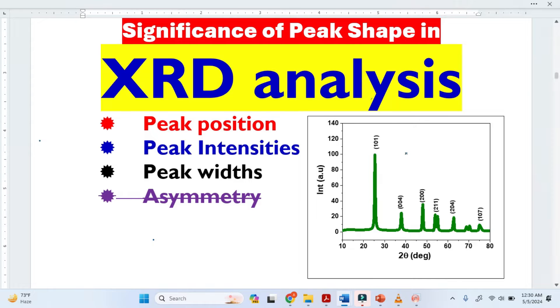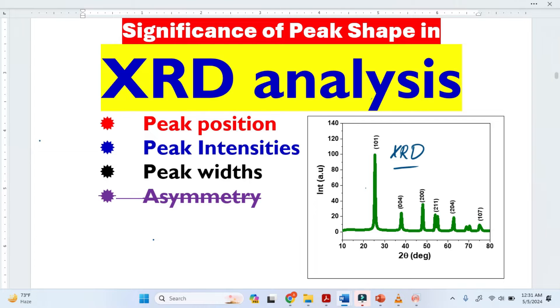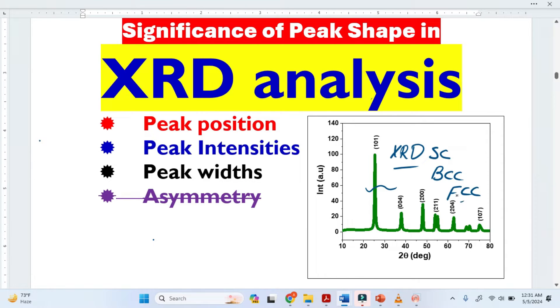Once we have the XRD pattern, we can extract a lot of information from this pattern. For example, we can extract what is the crystal structure of a material — whether it is a simple cubic, body-centered cubic, face-centered cubic, or hexagonal. So from this pattern, we can extract these kinds of information.